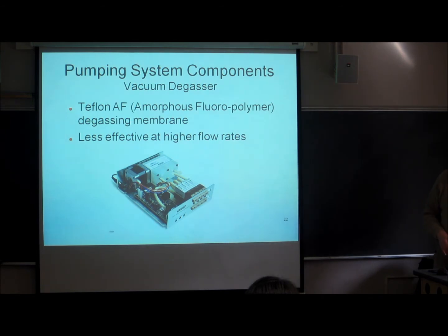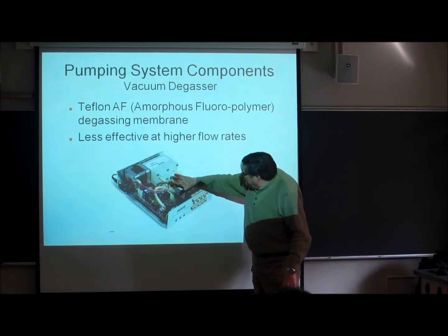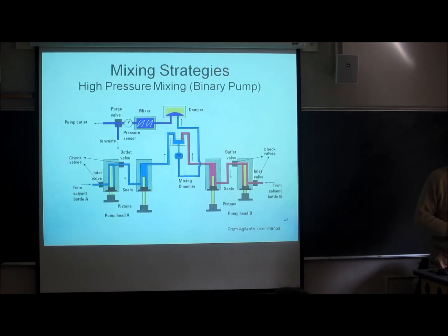Here's a degasser, a commercial one. You can see the Teflon tubes that are in here, and this is evacuated. The whole unit's evacuated. You don't have to use those things, but it sure is convenient.